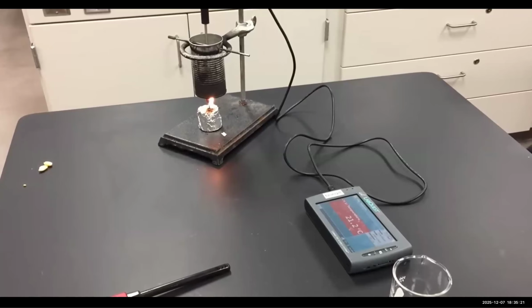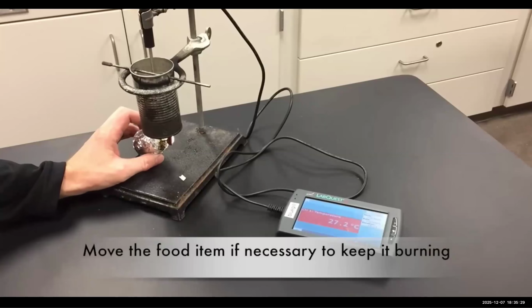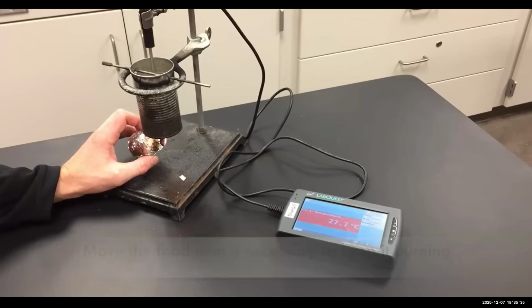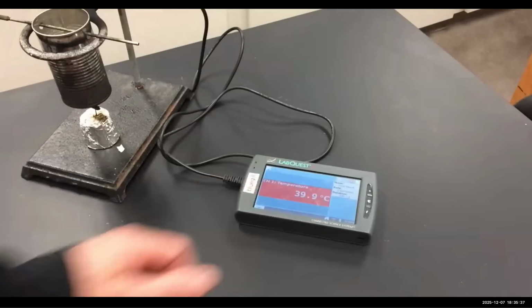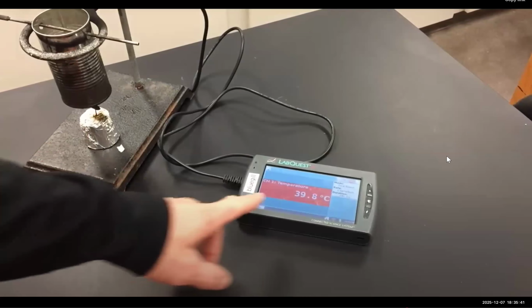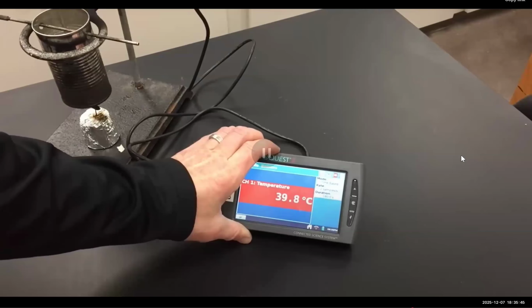Burning the food sample releases heat. That heat gets transferred to the water in the calorimeter, and the water in the calorimeter heats up. As you notice, the temperature of the water has increased already to about 27 Celsius. So we're going to continue to burn the food sample. After the food sample has finished burning, this is the final temperature of the water inside the calorimeter. So it's increased to almost 40 Celsius, which is quite remarkable.